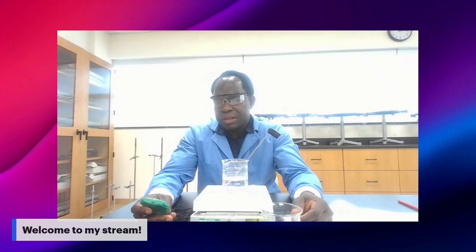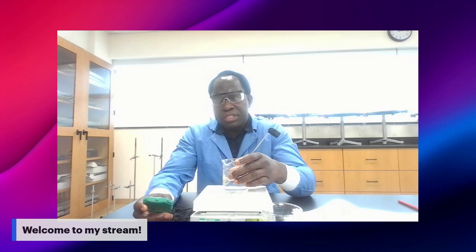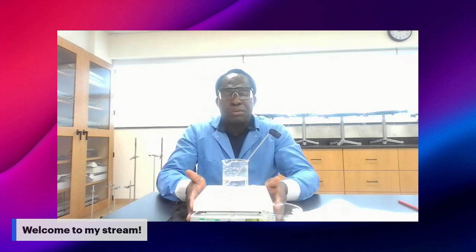Another thing I want to talk about is that before you put the water on the hot plate, make sure you turn the hot plate on 5 minutes before you start the experiment. Okay, very good. I think I gave you all the information you need to proceed to your lab.